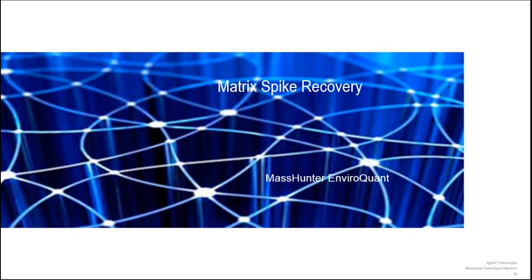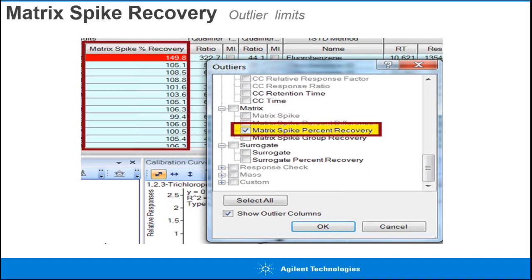All right, another important workflow is matrix spike recovery, often needed to satisfy the limits that the matrix, whether it's soil or water or however you've got it, passes through your sample prep. You need quality metrics. So we do provide those calculations for the surrogate, for the matrix spike, for the LCS type, with several matrix limits supported so that you can adjust that. And this calculation will be made automatically and check against those limits to give you a recovery.